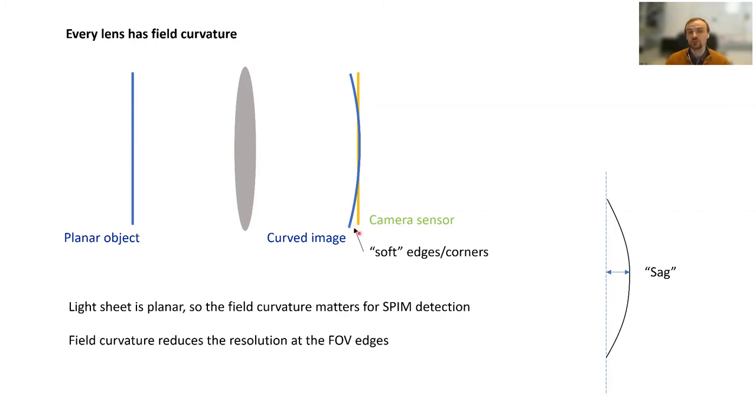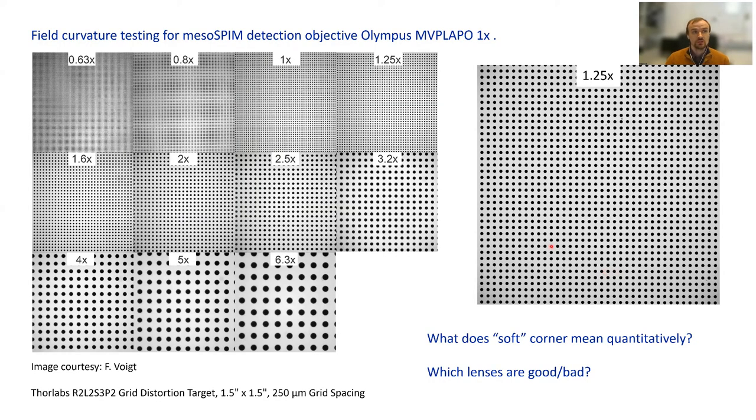One term from optics I introduce here is sag, which basically is the amplitude of this curvature across the field of view. We can test field curvature with the existing objective that mesoSPIM microscopes use, this 1x Olympus objective, at different zooms. You can put a distortion target from Thorlabs and you see, for example here at 2x, that the center is sharper and the sides are blurry. But how do we quantify this? How do we put a number on what field curvature we have? Is it good or bad for imaging?